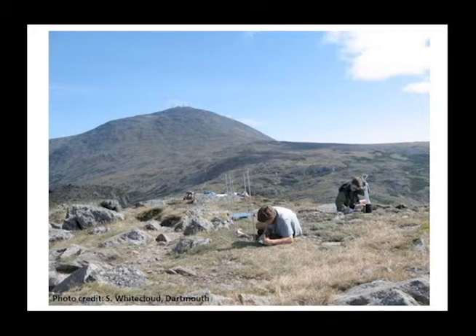And she can do the math and subtract them to be left with just the net photosynthesis of her low-lying plants. So Simone is hopeful for some publications in the near future and has certainly come up with a very innovative custom chamber to get around a very small leaved plant for study.